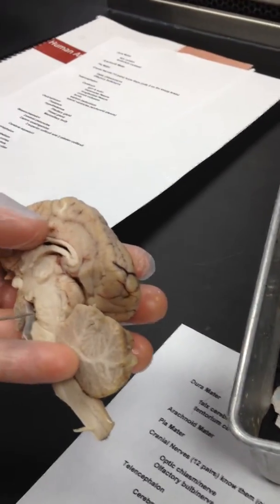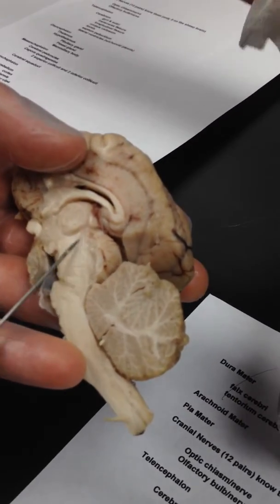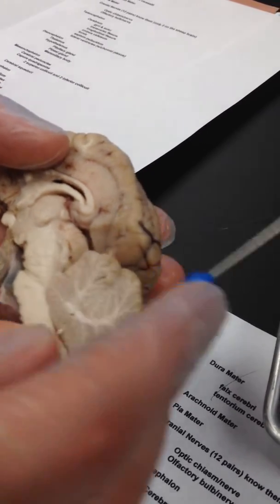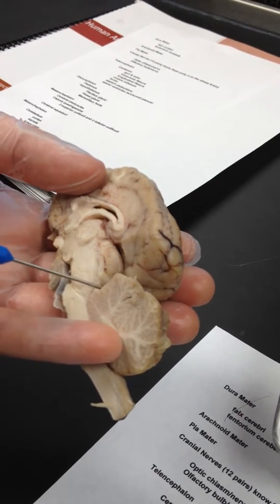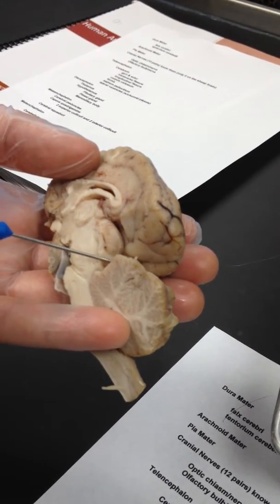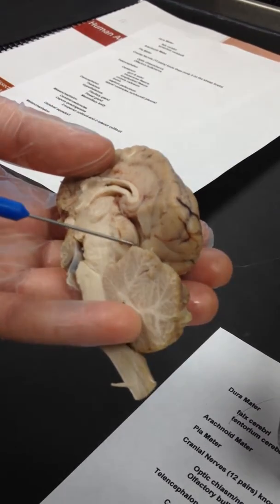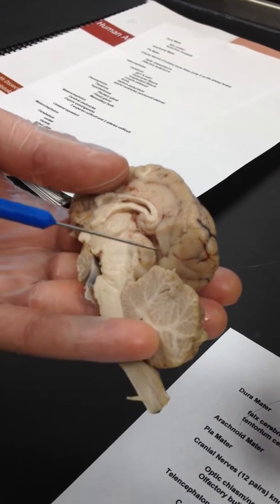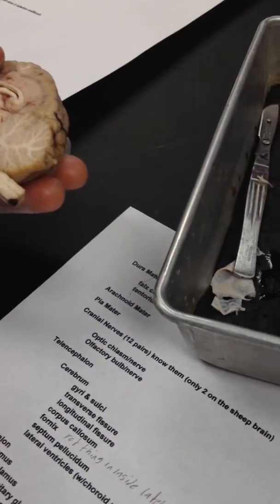So let's start with the peduncles. The peduncle on this sheep brain is really big. It's basically this area. It's right here. And then the corpora quadrigemina is here, but you'd have 2 sides to it, and they're composed of superior and inferior colliculi. So here's your superior colliculus, inferior colliculus.